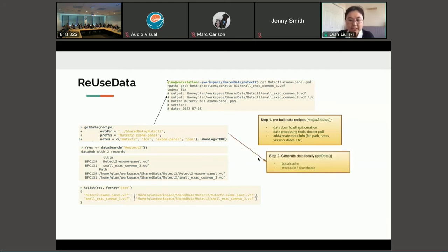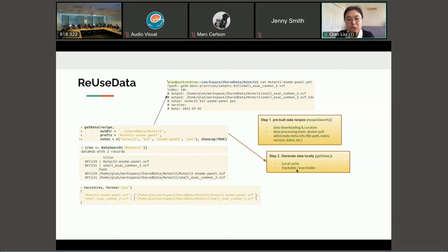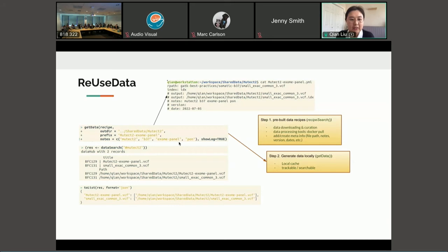So when you generate the data from the recipe, there will be keywords and meta information added automatically. So the second step is to generate the data locally. So it will create a local cache for all the data which are more trackable and searchable with all the argumentum nodes. You can add all the keywords over here which can be used for the later data search.